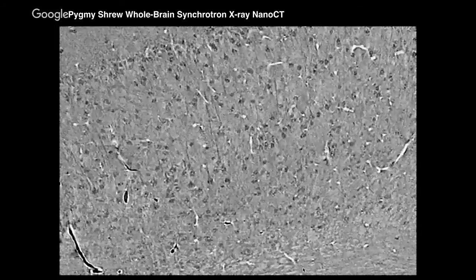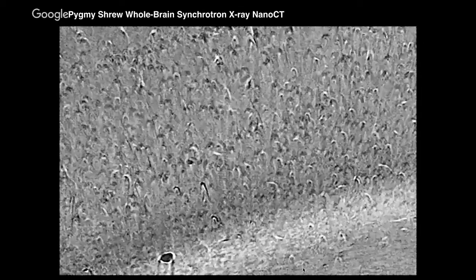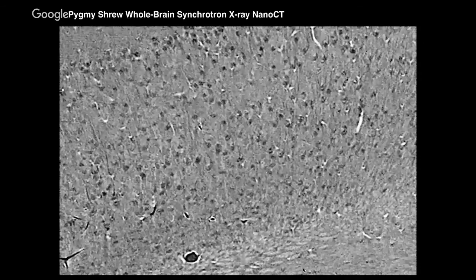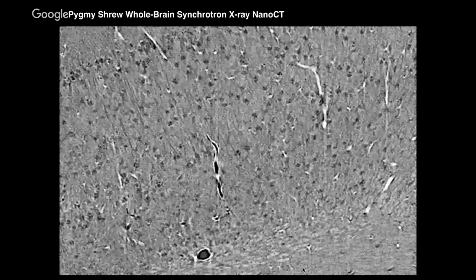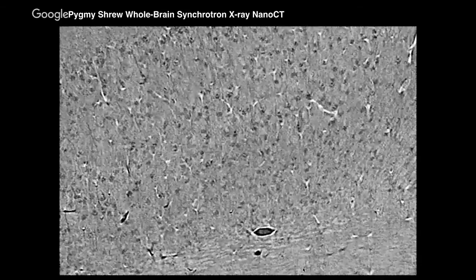So the resolution here is submicron. It really is nanoscale. It's closer to half a micron. And so this is showing cortex in the upper part, and then at the very bottom right, you see the external capsule, the white matter coming into view.